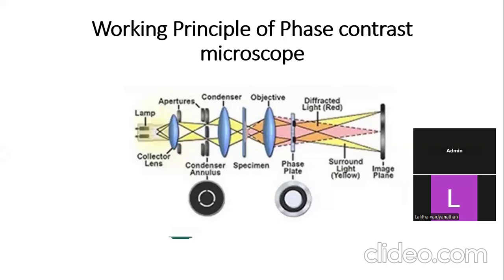Okay, as such, we can go for image screening. Examination of the intracellular components is possible at relatively high resolution, for example the dynamic motility of mitochondria, mitotic chromosomes, and vacuoles can be examined in a very high resolution way.